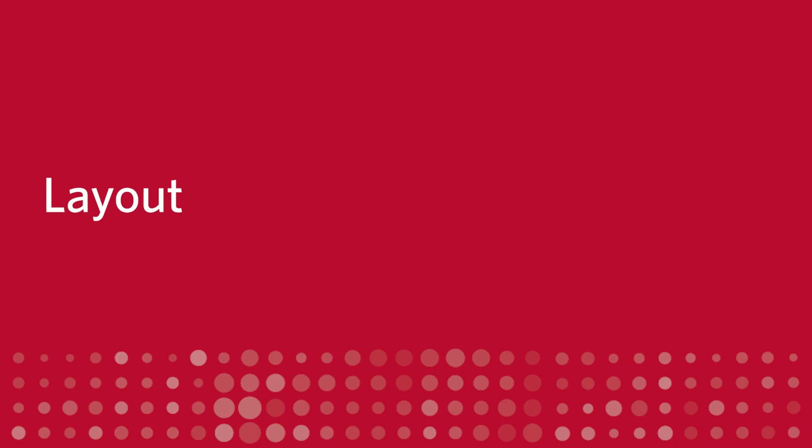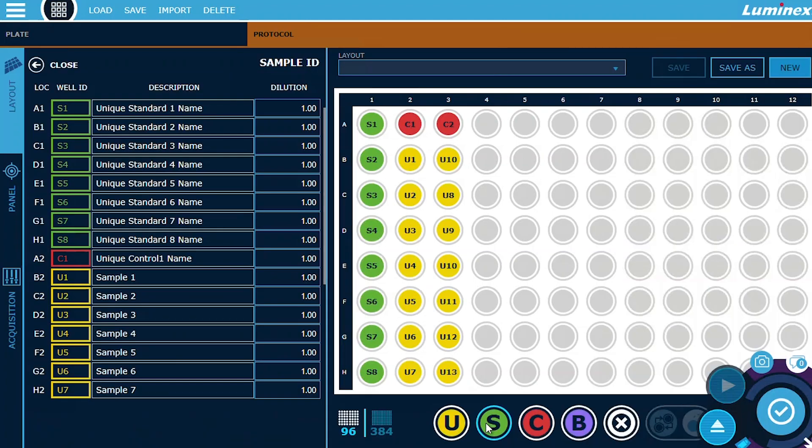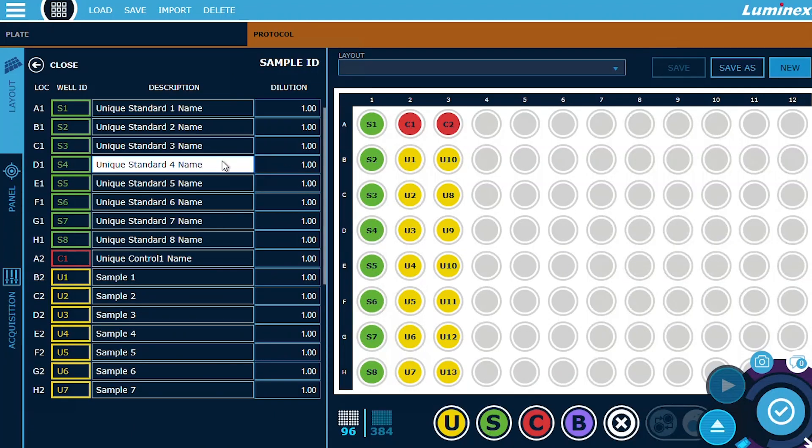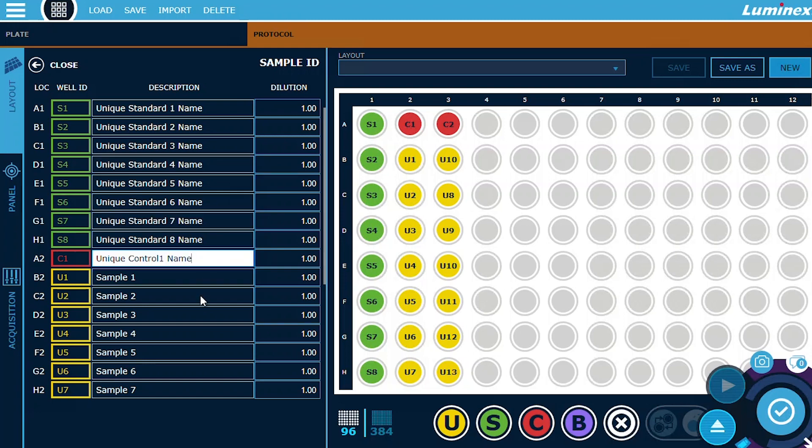Layout. Software Version 2.0 introduces the ability to assign identifiers to standard and control well types, in addition to the unknown well type. This enables better organization and enhanced traceability in your experiments.